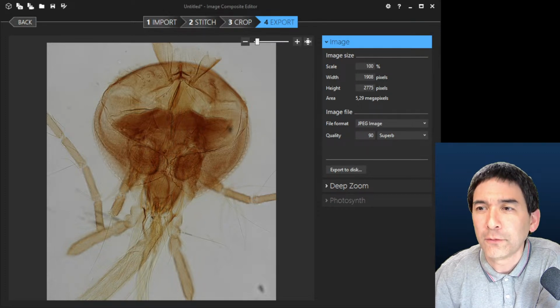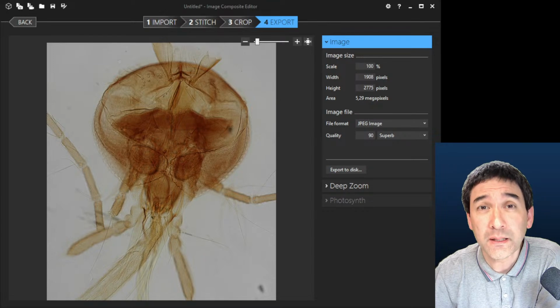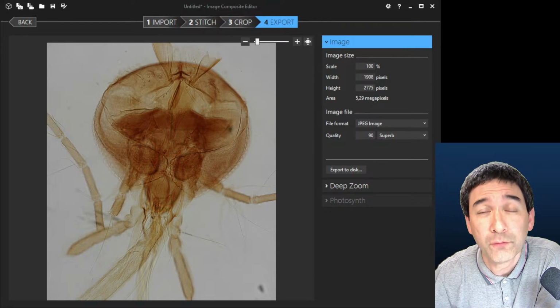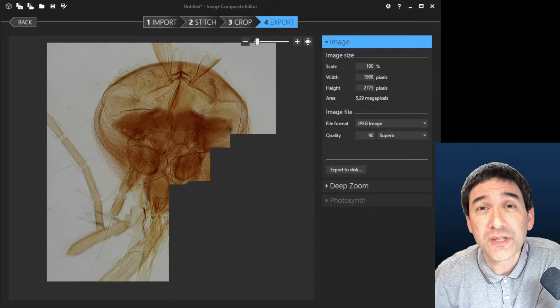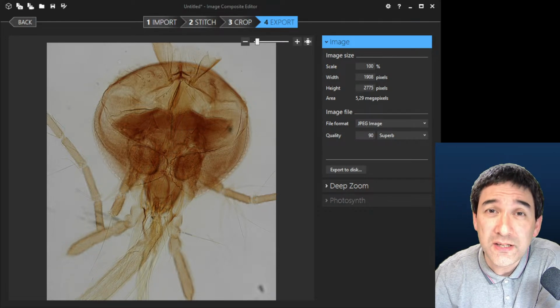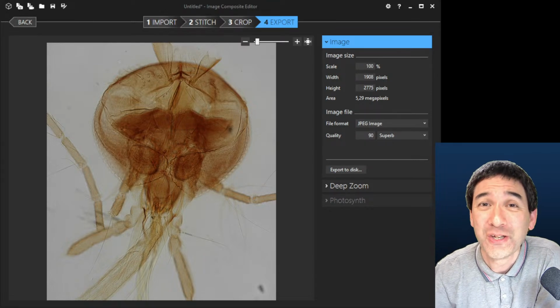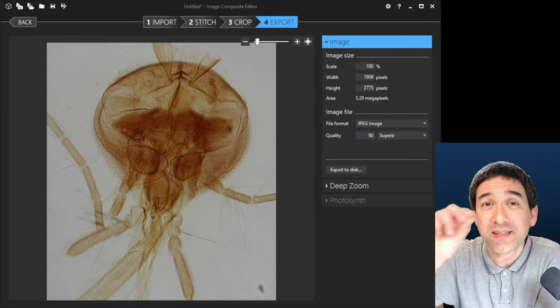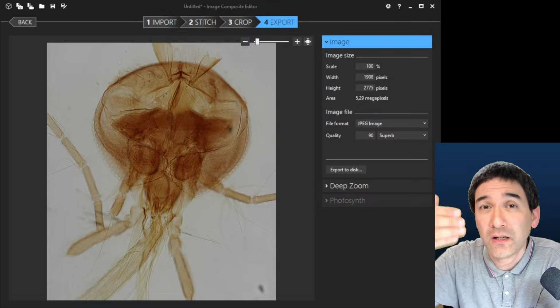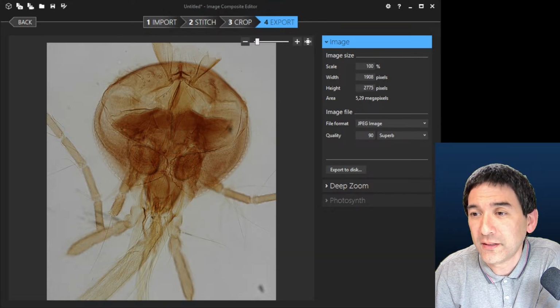How about Photoshop for stitching? I have also done that. I don't know about the modern Photoshop versions, but for the images that I had to stitch, I find it more useful to actually make videos. It's simply easier. With the old Photoshop version that I had, I had to take a lot of overlapping pictures, and this was not so automatic. Sometimes I had to define the points manually of how it's stitched together.